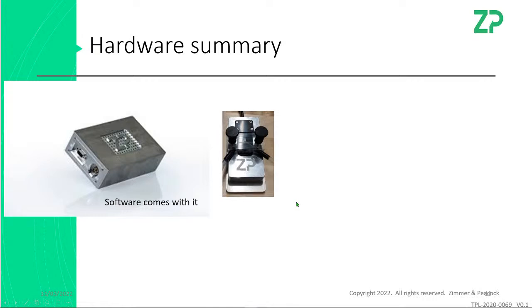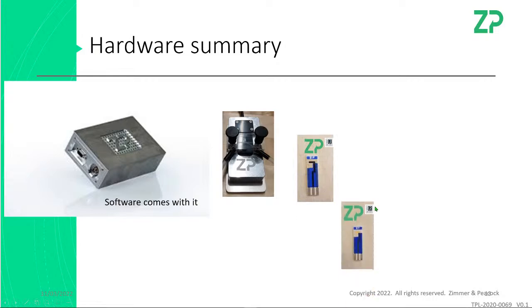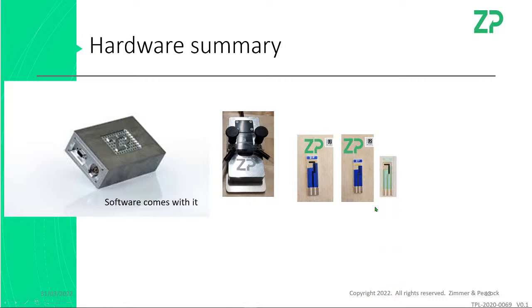You will need an adapter like this, so that in the first instance you can just put a screen printed electrode in there, and I would drop on that let's say a 30 to 50 microliter drop of cells and just measure it without any flow. The electrodes that you need will be the carbon 303, the gold 303, and I would recommend trying the hypervalue electrodes as well.